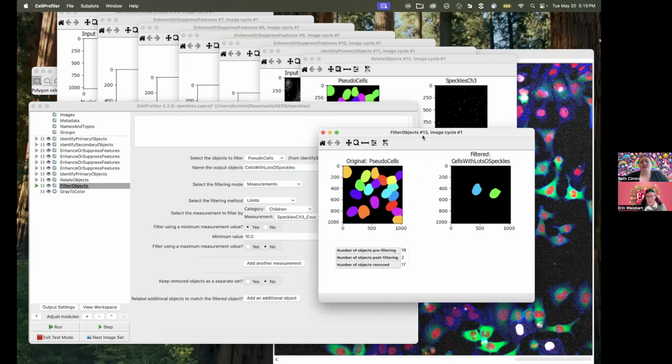So the more you can think about what's going to be consistent experiment to experiment, the more you can make a pipeline that you don't have to adjust every time you do an experiment. That's a great principle to think about, certainly for this use case, but just building quantitative bioimage analysis pipelines in general, a really good thing to keep forefront in your mind as you work on any new pipeline. Yeah. I want folks to generally be lazier at building pipelines, and the way you make them lazy but still useful is by thinking about what's going to change each time and not building your pipelines around that. Absolutely.